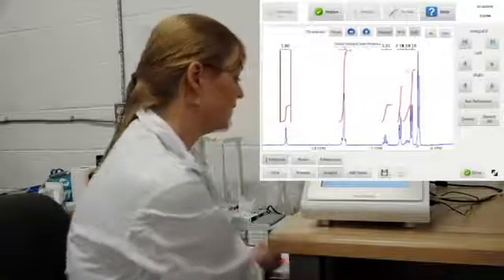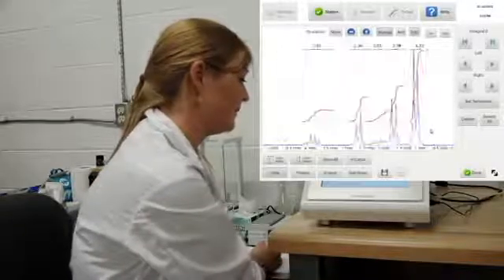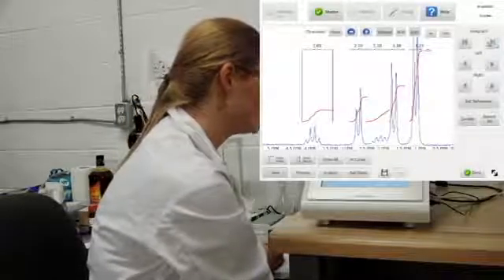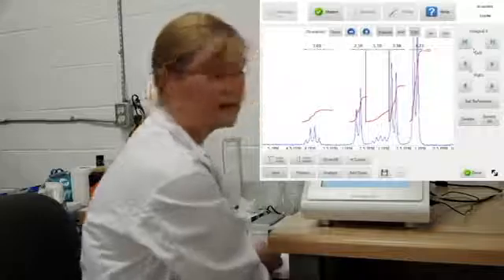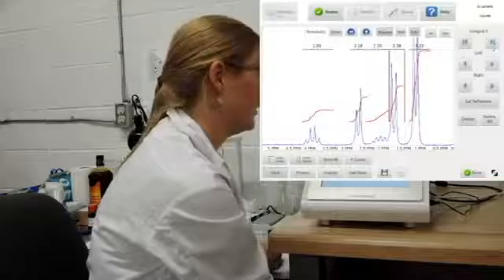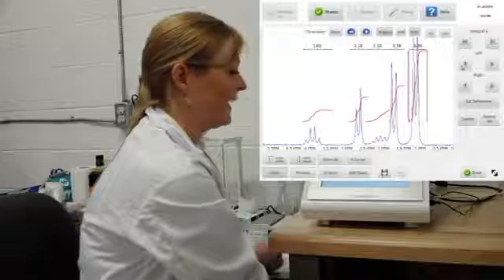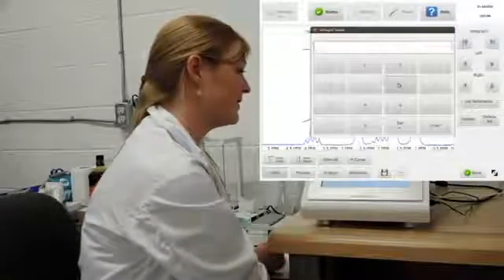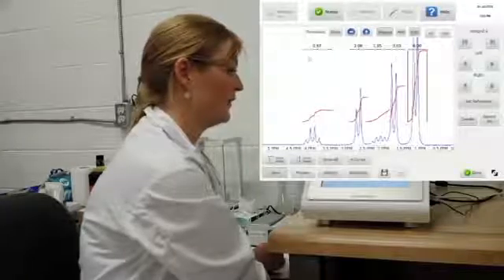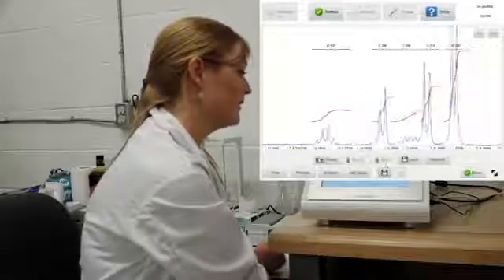Okay, so it's a little bit hard to see in here, so I'm going to use my view. I'm going to zoom in on the alkyl region so they space out a little bit, maybe give them a little bit more height. And I'm going to go over and just make sure I'm happy with what my integrals look like. There, of course, is a little bit of overlap here, so the integrals don't look the best. But I can still get pretty accurate integrations from them anyway. So I'm going to pull in my tail here, extend this tail, and again, this is 2 methyl groups, so I'm going to integrate them to 6. So they integrate 6 to 3 to the next methyl group, approximately 1 for both of the methynes, and 2 for the methylene. Okay, so I'm going to save this locally as well.